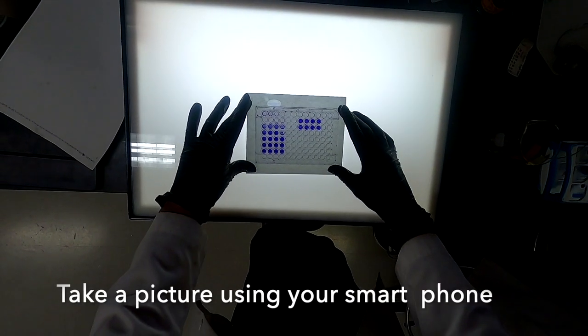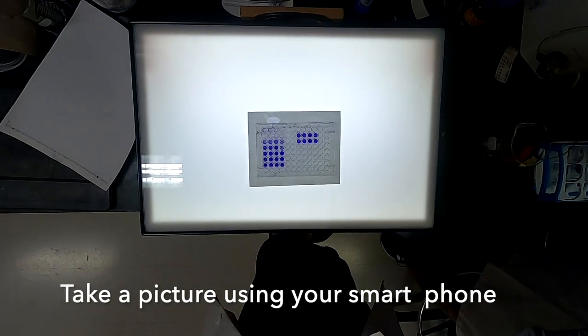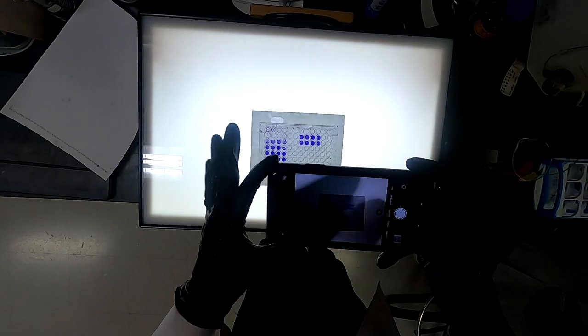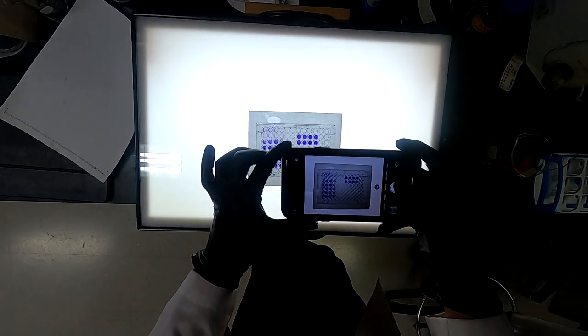To finalize our experiment, we are ready to take a picture using our smartphone in order to analyze for our lab reports.